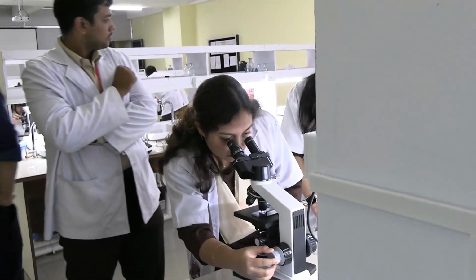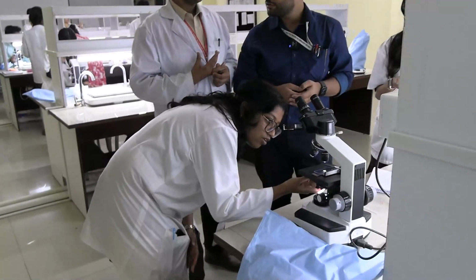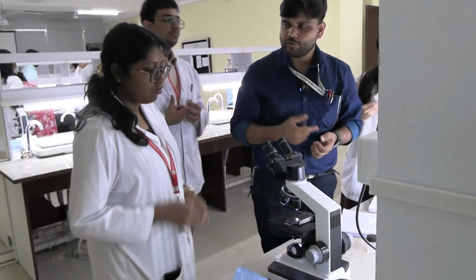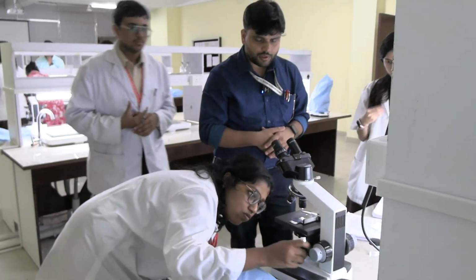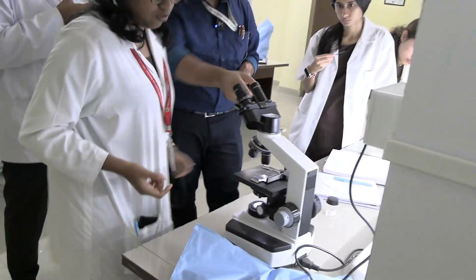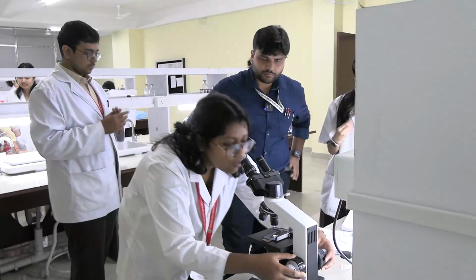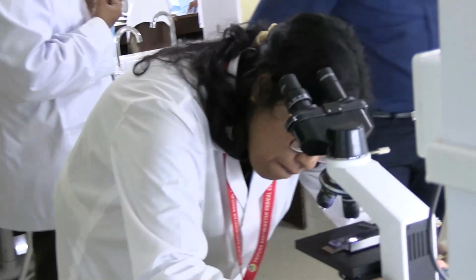Tiash, have you found something? No, sir. You are trying now? Okay. No, condenser is not open. Condenser is like up or down. Will the location be at the highest or the lowest? Sir, highest. Highest, okay. And the diaphragm will be open, fully open. Okay. So you can do now. First check if the diaphragm is fully opened. If the condenser is fully at the top. Yes, sir. Is the objective lens placed? Yes, sir, it's 100. Is it the 100x or the other? Okay, it's a 100x. Okay. So you're going to raise the platform first and adjust the mechanical stage.